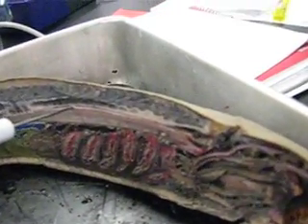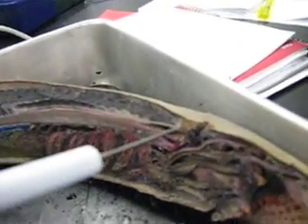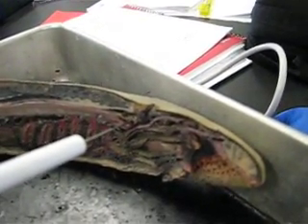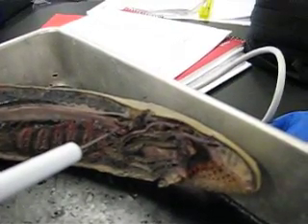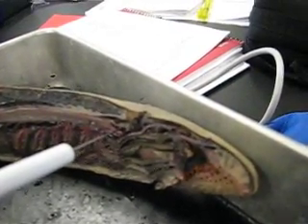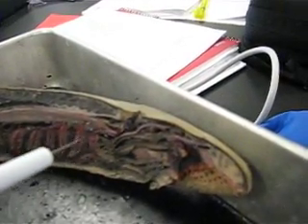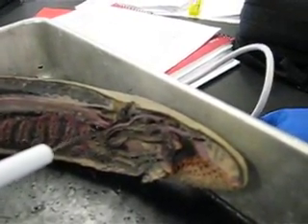This is the spinal cord. This is the pineal gland. This is the brain, which is the most anterior part of the nervous cord, or spinal cord. This is the hypophysial pouch, which is just beneath the notochord.